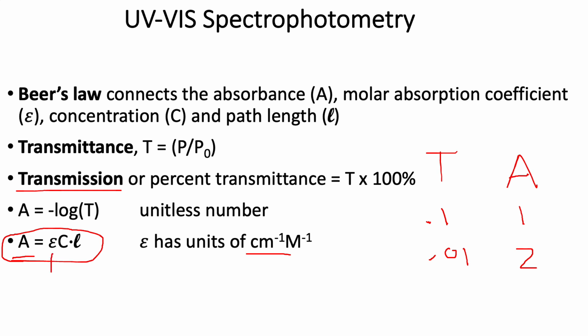And this other number here, which is the extinction coefficient, is specific to the particular compound you're dealing with, and it's specific to the wavelength range you are in. So this actually is the spectrum. When you see a spectrum, you're really plotting the extinction coefficient because it's a function of wavelength. So you decide when you're doing an experiment what wavelength you're going to work on with what compound, and that will define the extinction coefficient.